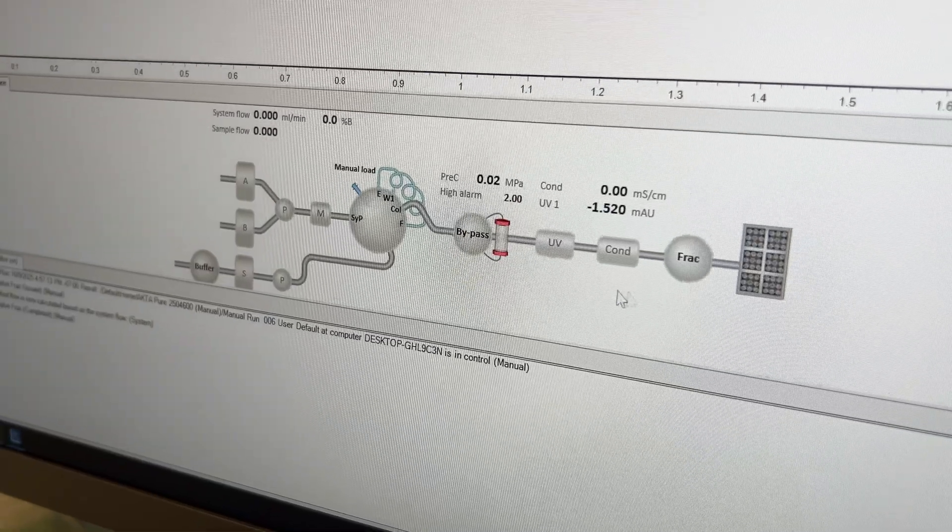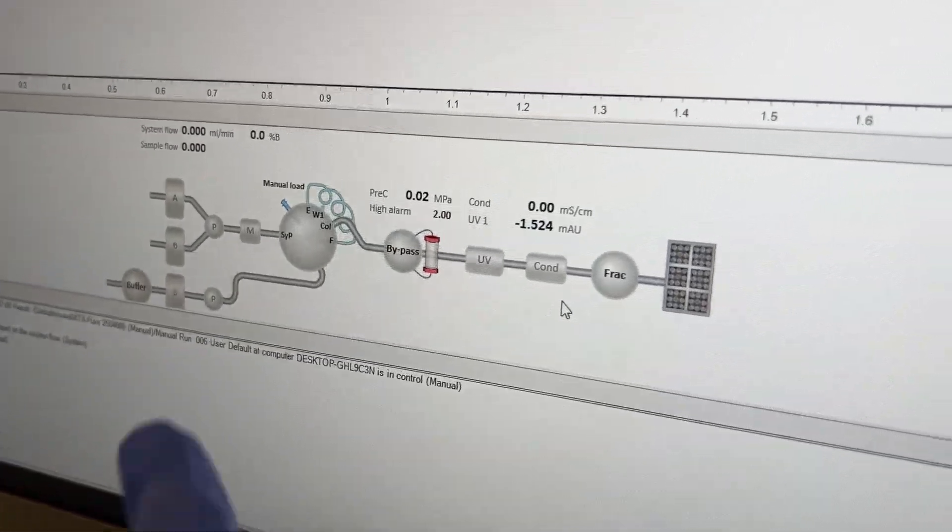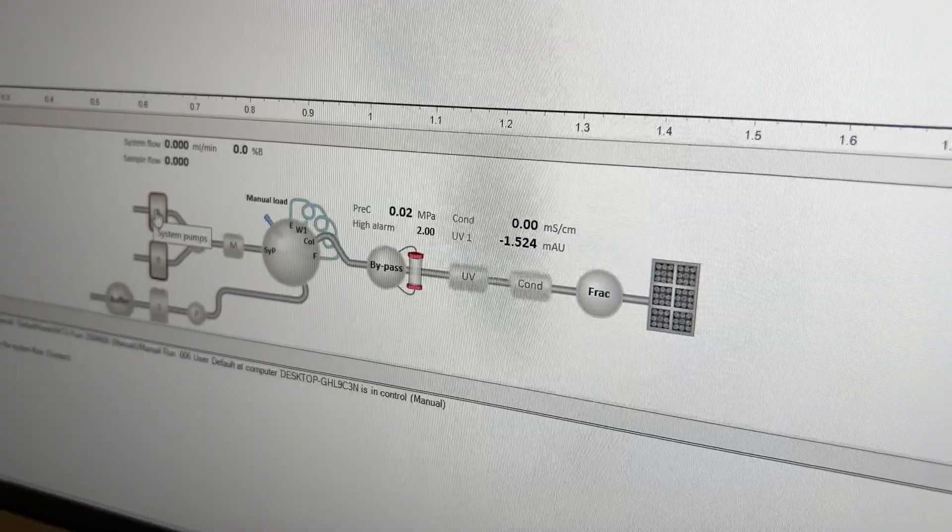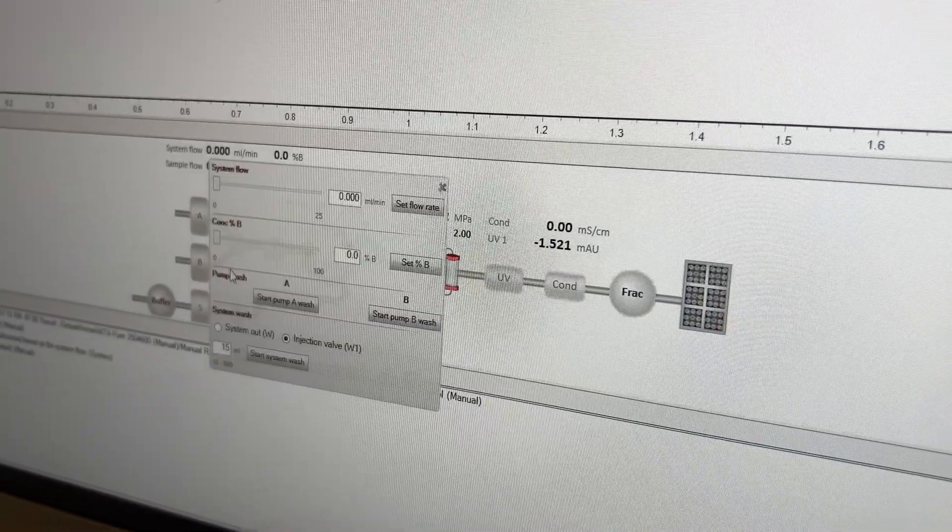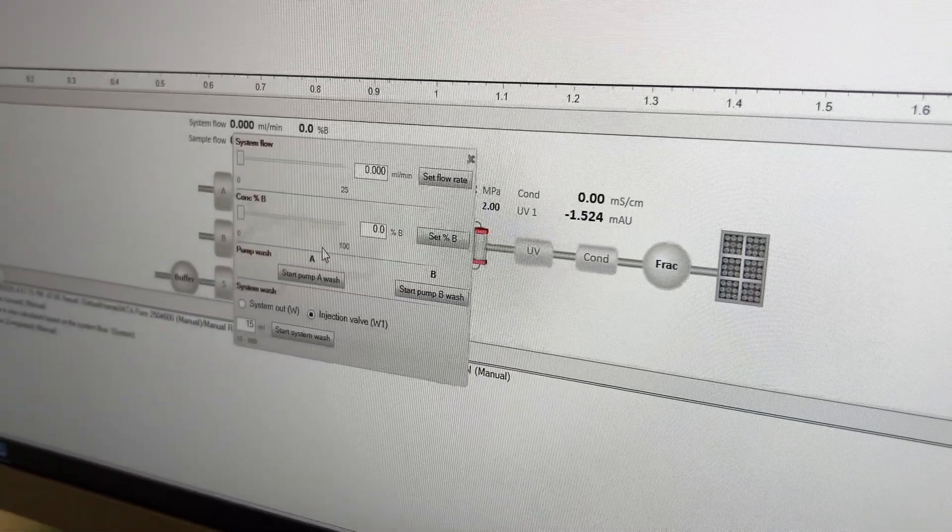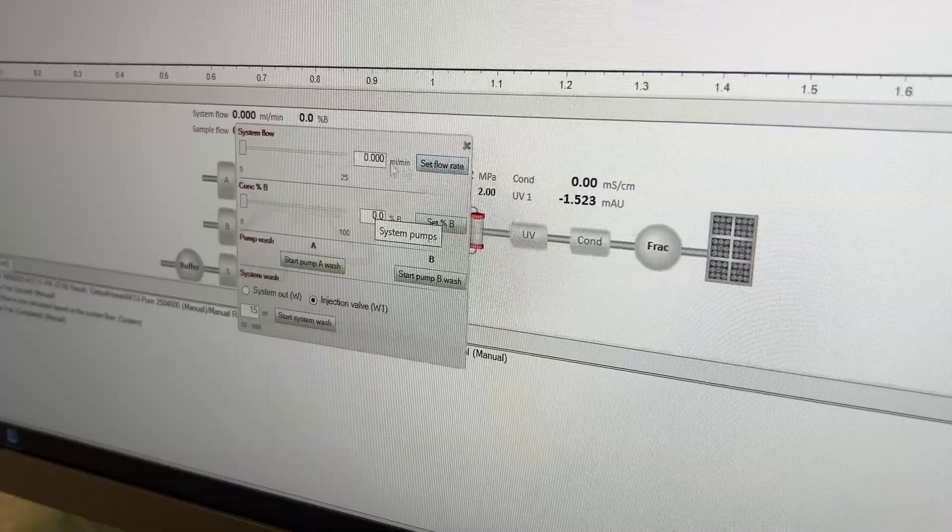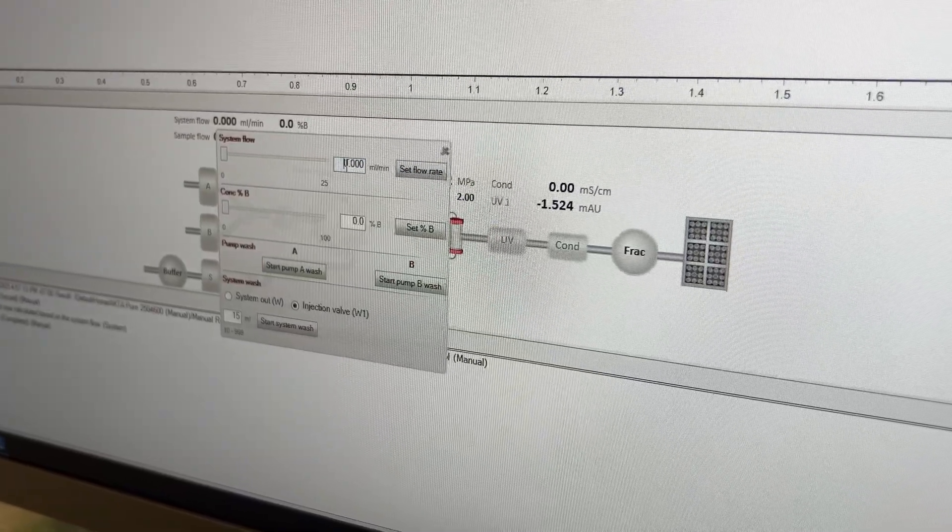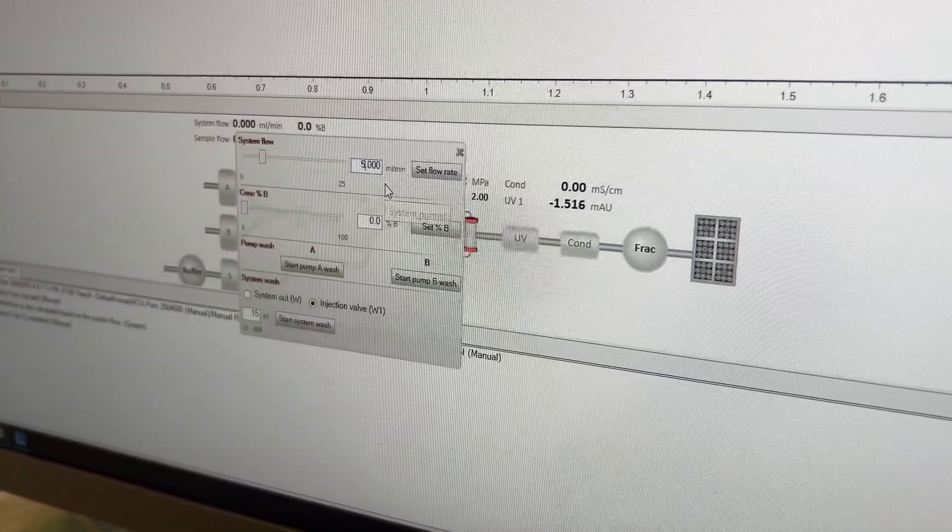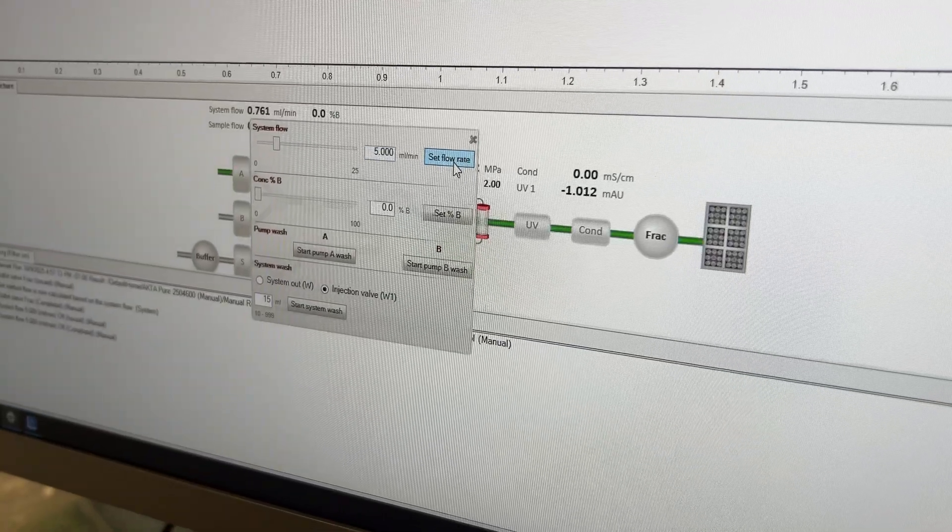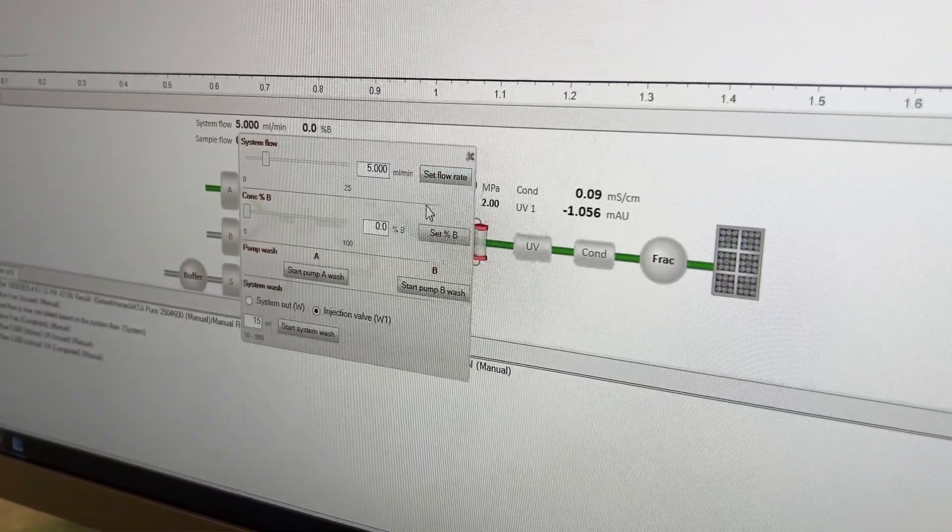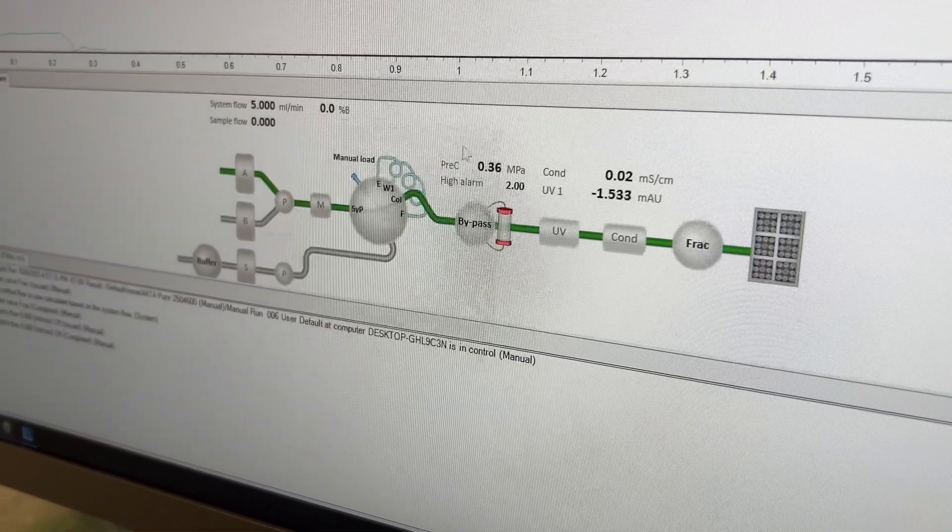We can go ahead and take our pump A. So we go to our pump A, which is in our water. We're going to set the system flow rate for five mils per minute. Set flow rate. And now we're just going to let it go.